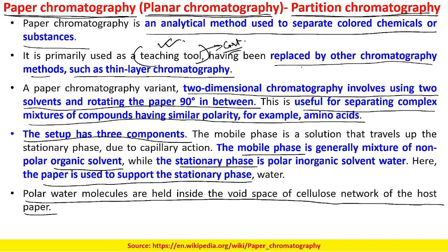Now, when you have the filter paper, herein we use filter paper actually. You dip the filter paper in water. Due to capillary action, the water will be absorbed within the filter paper and it will be completely wet. So we have this filter paper, which I have dipped in water, and it is now completely wet. Before dipping it, I made a line with a pencil. Now on this line I will be adding my analytes.